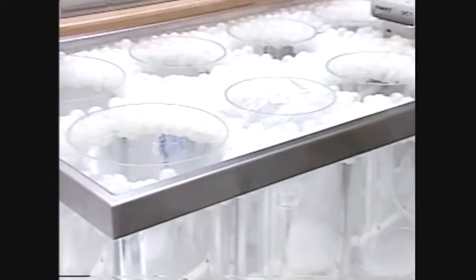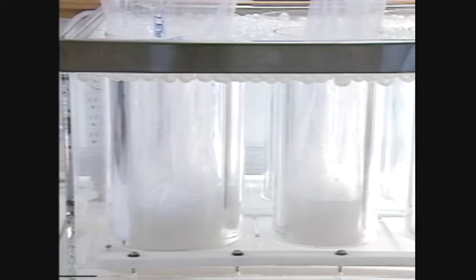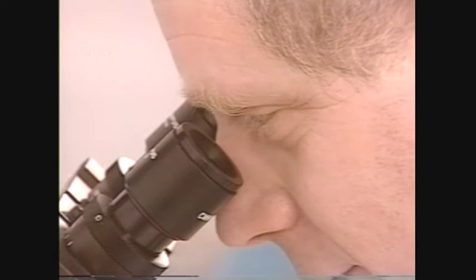Two or more ejaculates can be pooled immediately after extending. If one or more extended ejaculates must be held for pooling while additional boars are collected, keep them in the water bath to maintain their temperature. After adding all extended ejaculates to a pool, the quality should be assessed microscopically.